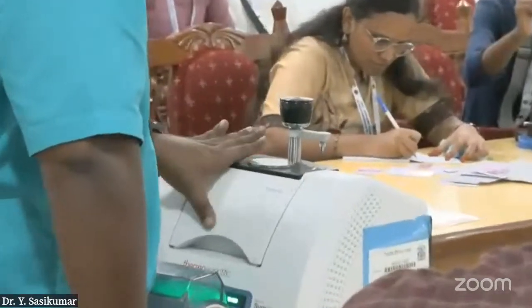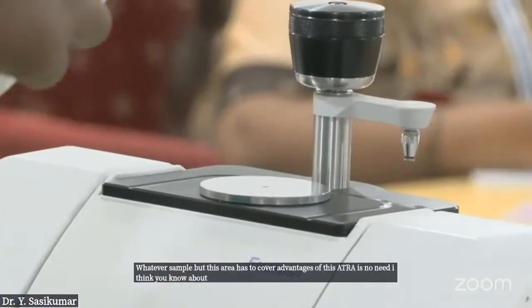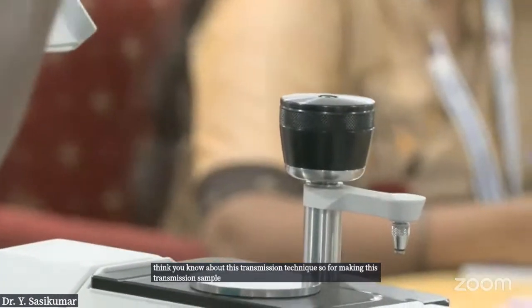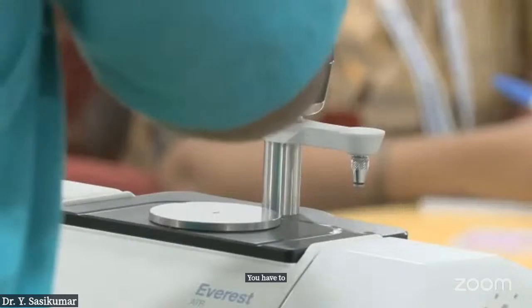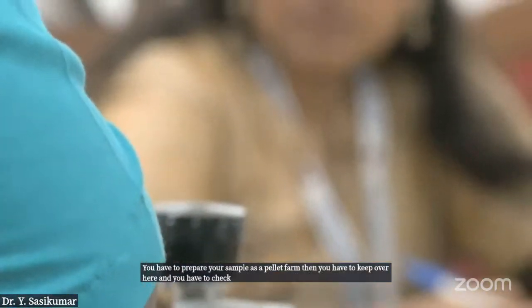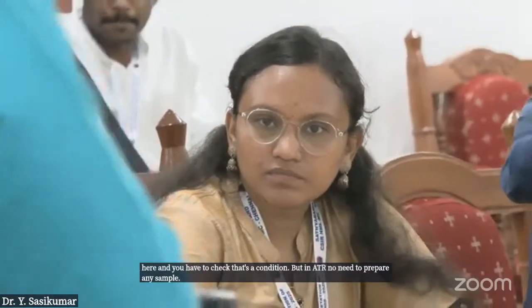The advantage of this ATR is no need for sample preparation. I think you know about this transmission technique. For making a transmission sample, you need to go with a hydraulic press. You have to prepare your sample in pellet form, then keep it over here and check. That's a condition. But in ATR, no need to prepare any sample. Whatever sample you have in your hand, you can keep directly.